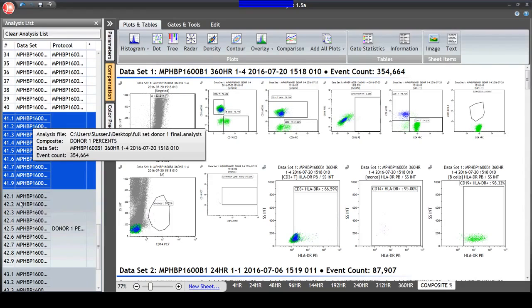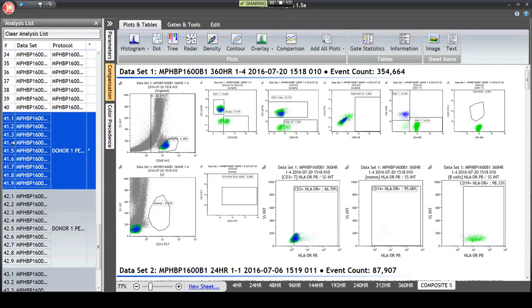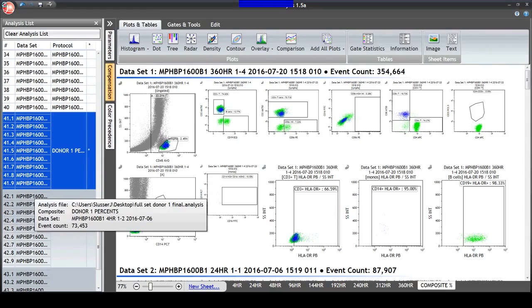So I kind of sidetracked myself there by showing you how to repopulate that, but that's exactly what I did. I built this one. And moving on to the next slide.